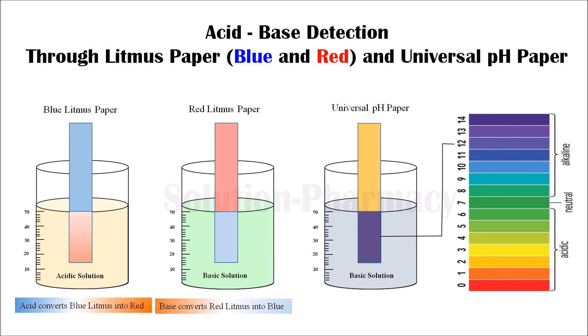So this is how we can determine the nature of our solution — whether it is acidic or basic — using blue and red litmus paper. By using universal pH paper we can determine the approximate pH value of the solution, as the solution changes the color of the pH paper according to its pH. This is the quick method to get the pH value of a solution. Thank you very much for watching this video.